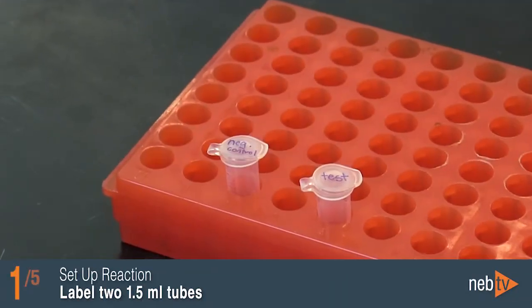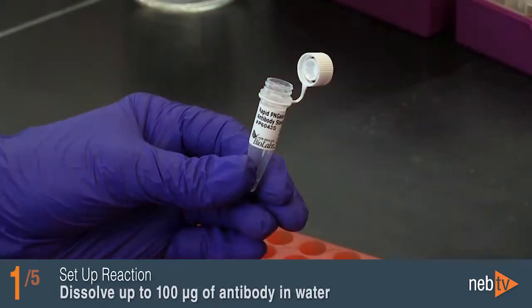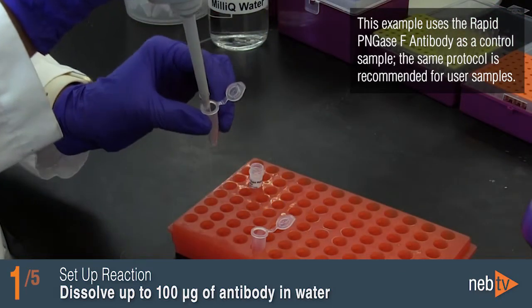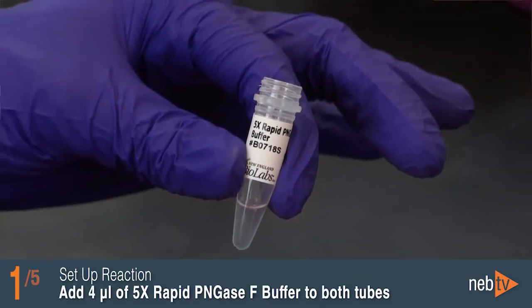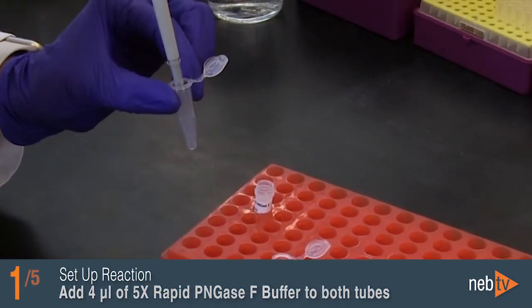Label two 1.5 milliliter tubes: one for the negative control and one for the test. Dissolve up to 100 micrograms of IgG in water to a total volume of 16 microliters in both tubes. Add 4 microliters of 5X Rapid PNGase F buffer to both tubes containing the IgG and water mixture, and mix gently with the pipette.